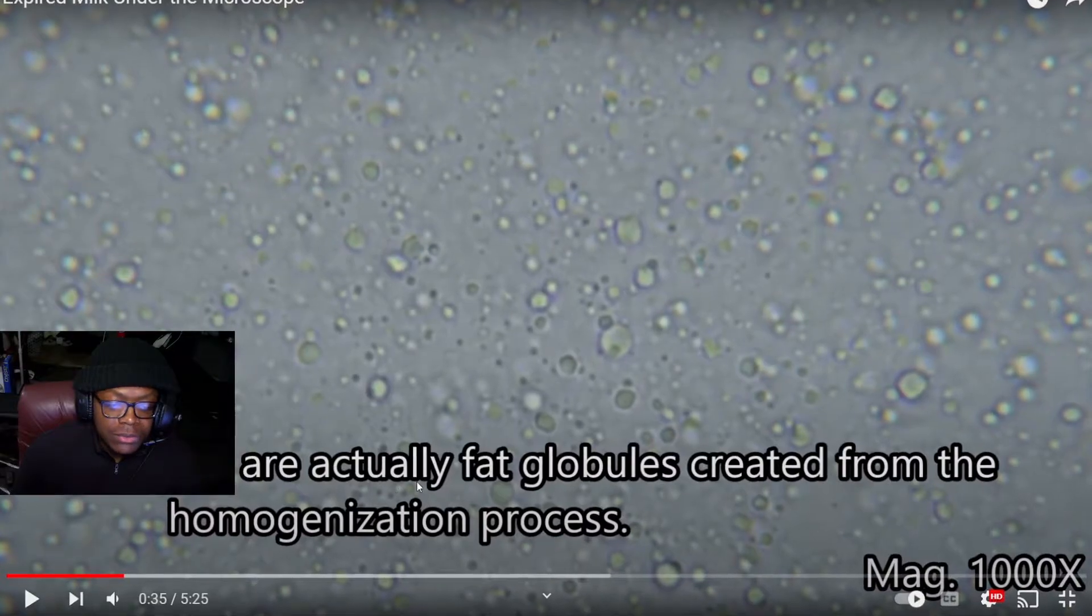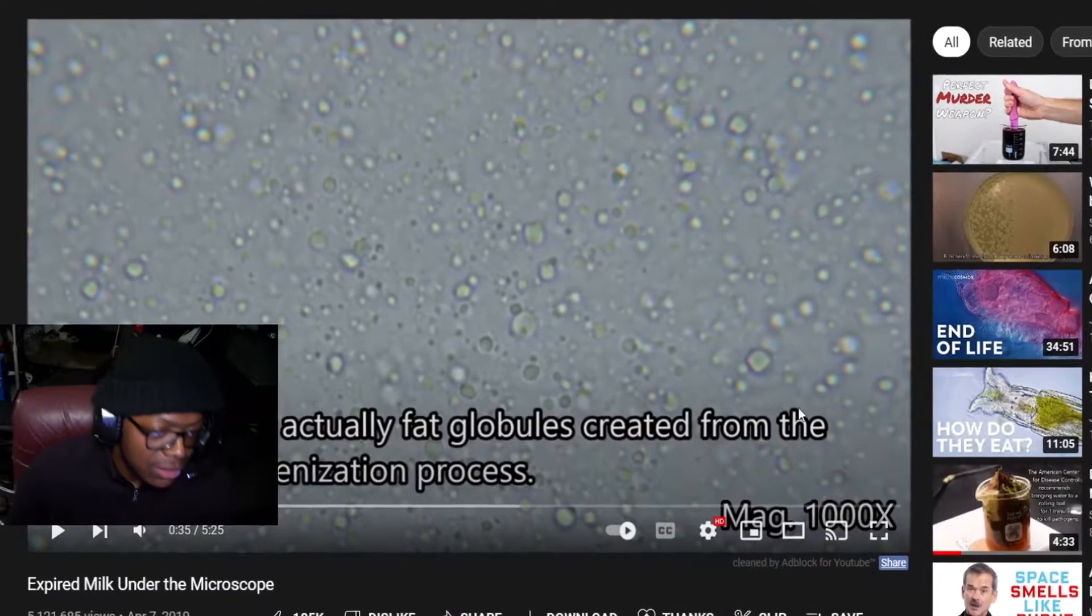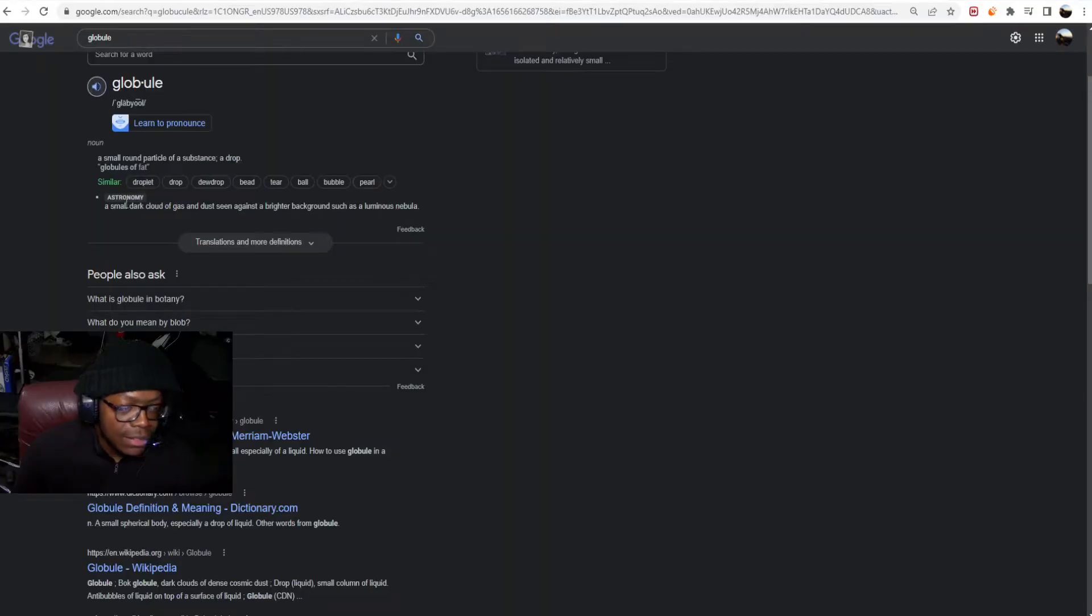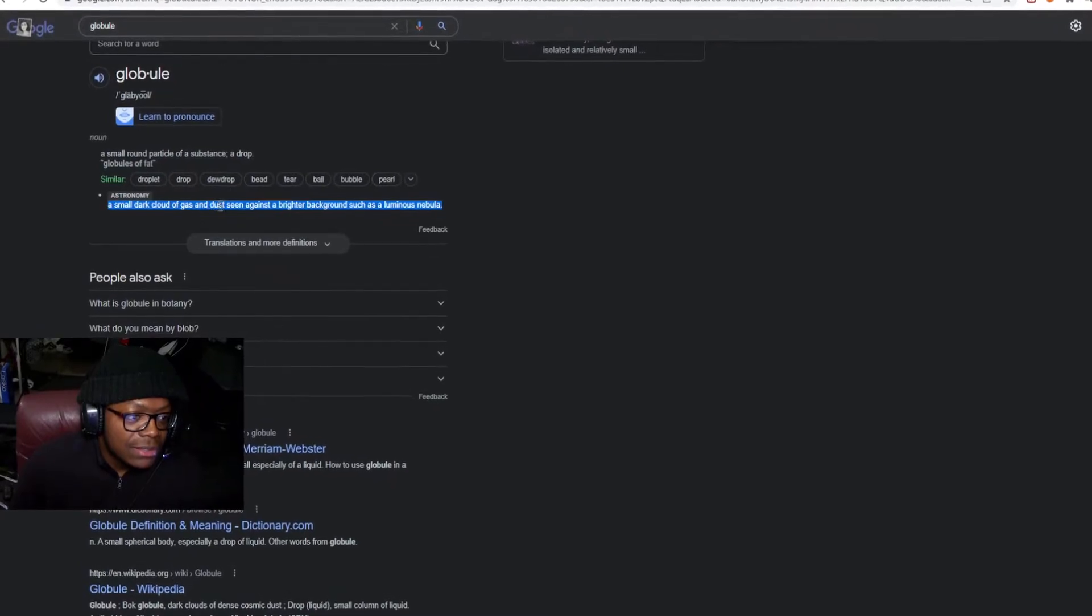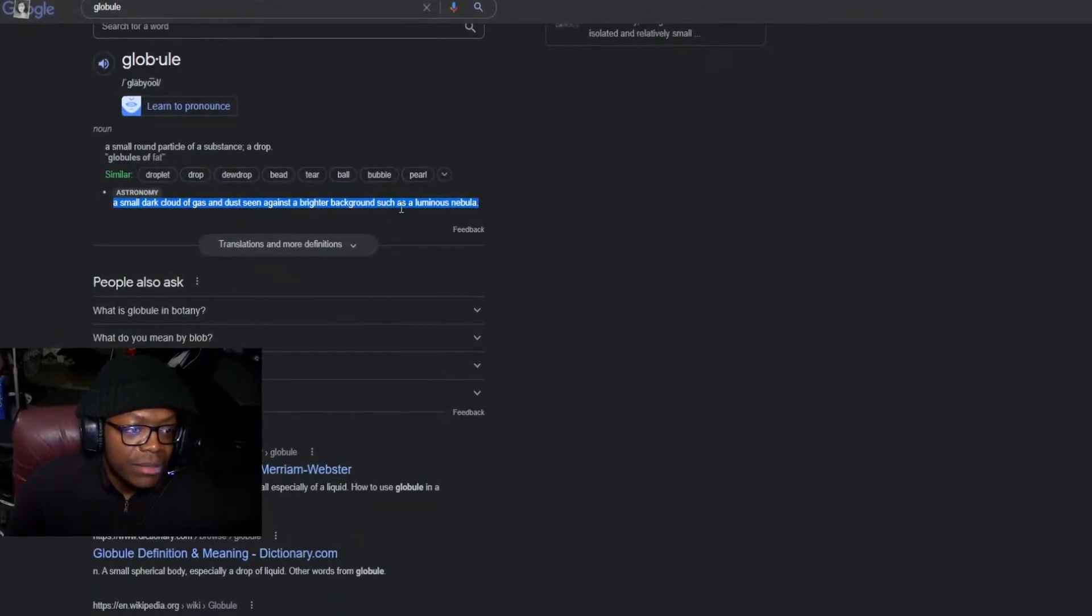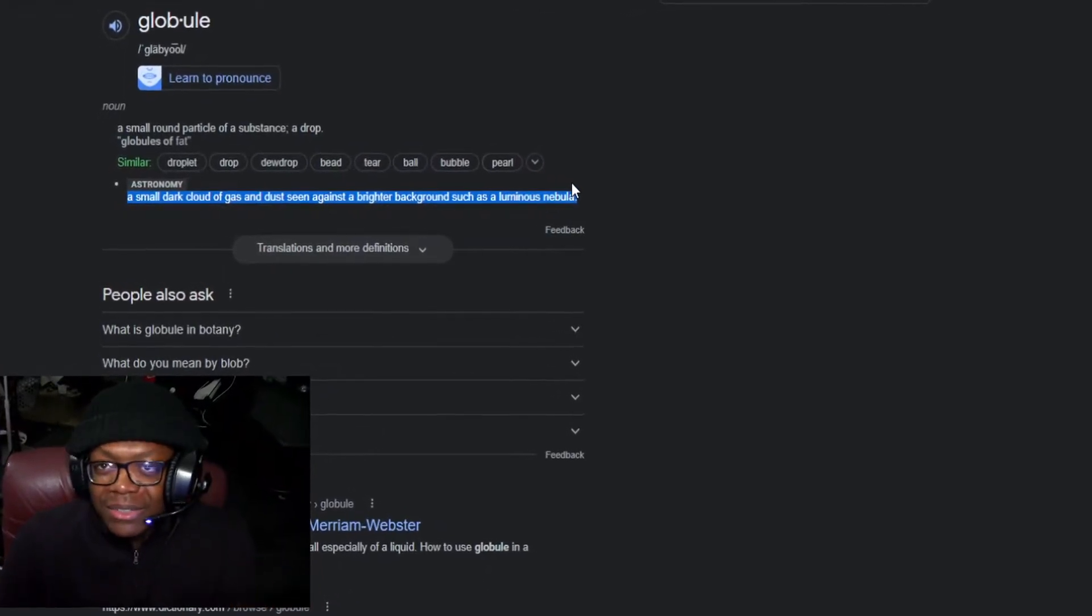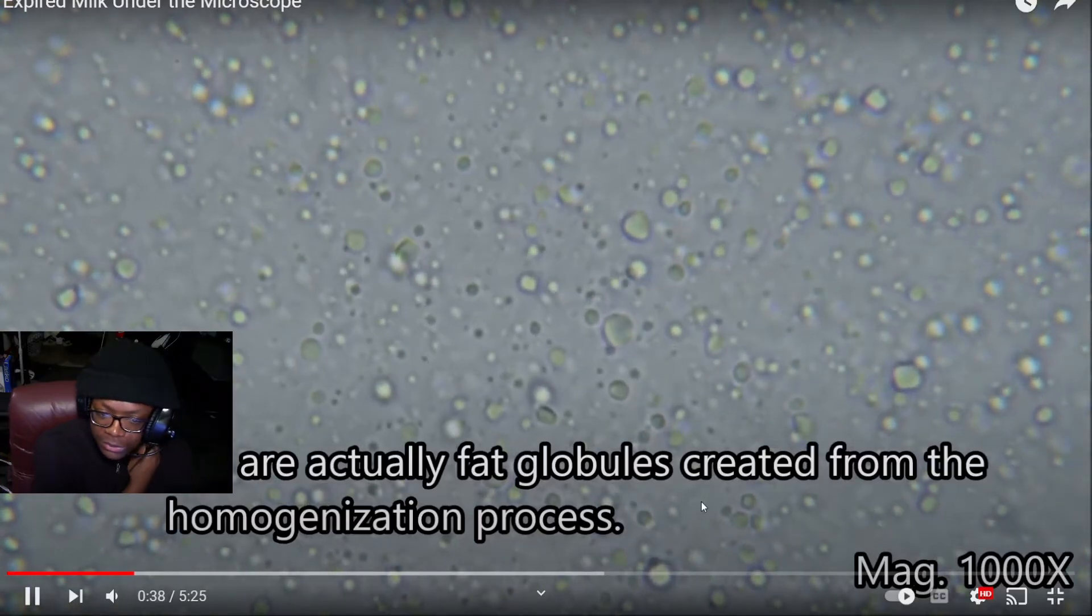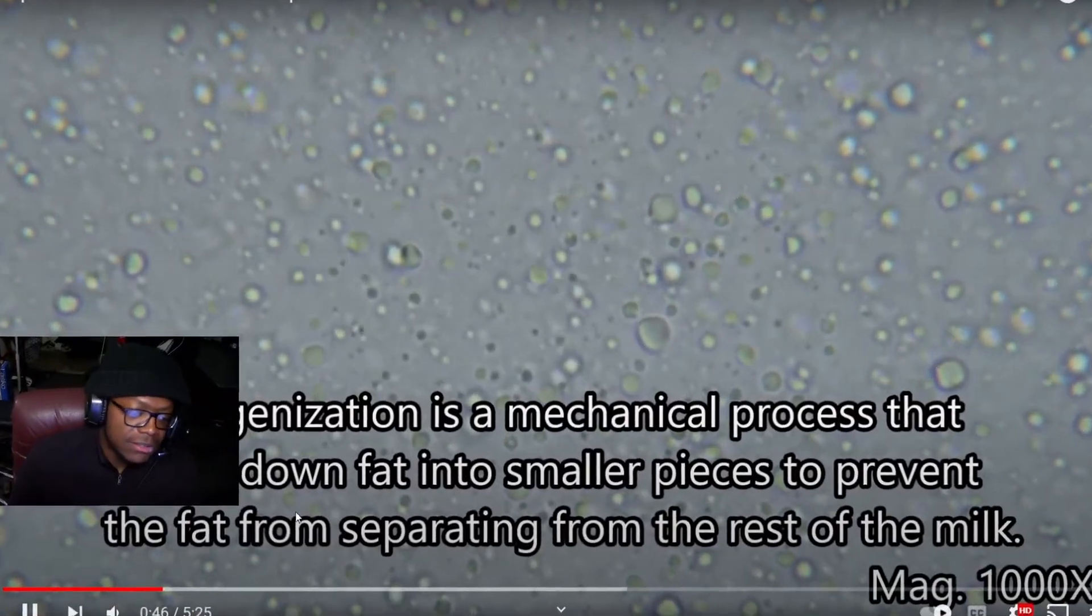These are actually fat globules created from the homogenization process. Globule, globule... I'm dyslexic. Globules are created from the homogenization process, a mechanical process that breaks down fats into smaller pieces to prevent fat from separating from the rest of the milk.